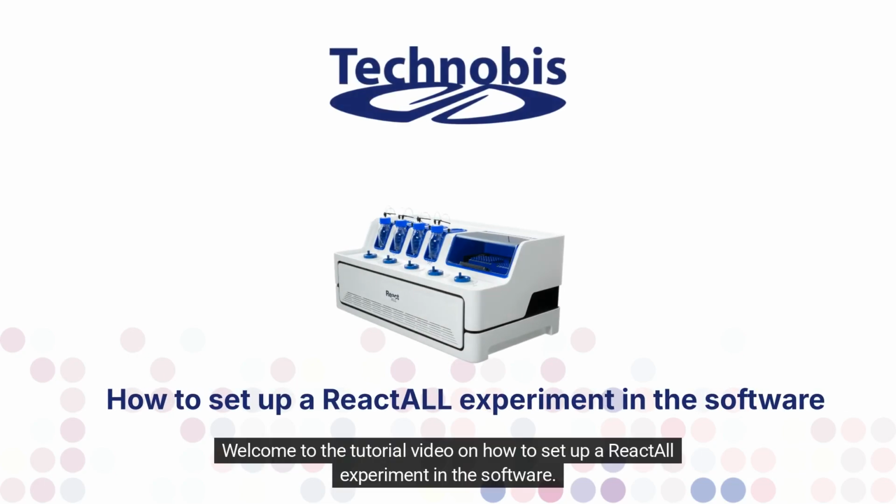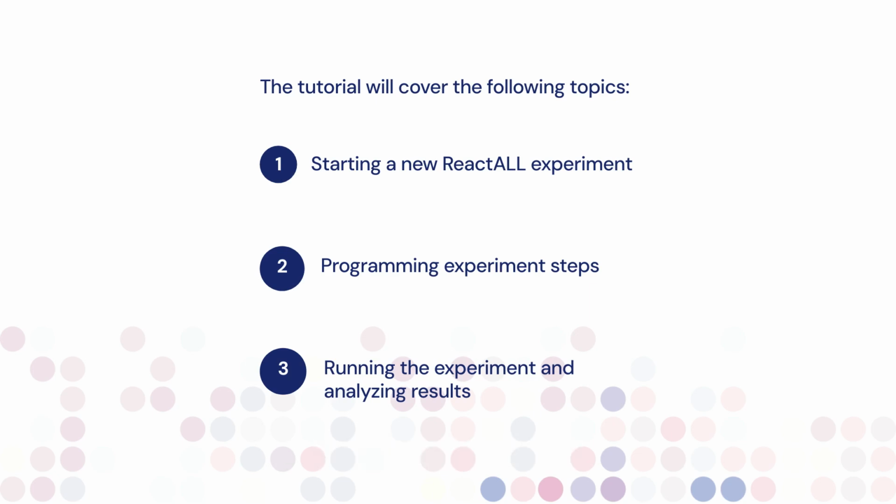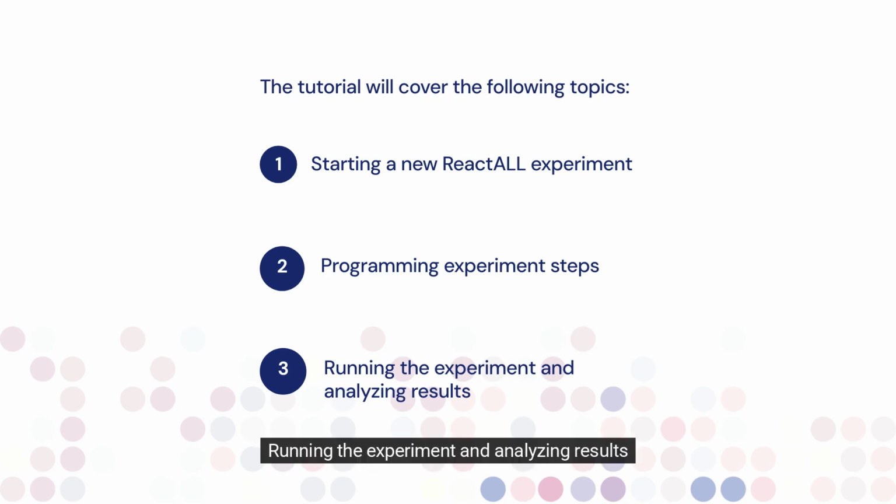Welcome to the tutorial video on how to set up a ReactALL experiment in the software. This video will cover the following topics: starting a new ReactALL experiment, programming experiment steps, running the experiment and analyzing results.